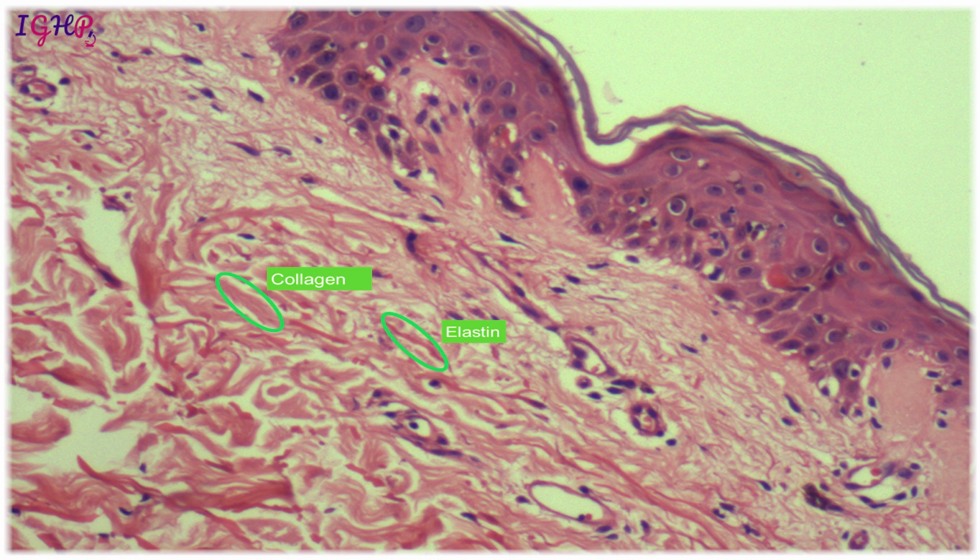Now if you look carefully, this connective tissue is made up of some dark eosinophilic fibers, which are these wavy fibers, and some lightly eosinophilic fibers, which are these fibers. So actually this is a combination of collagen and elastin. These dark eosinophilic ones are the elastin fibers, and these broad wavy fibers are the collagen fibers.